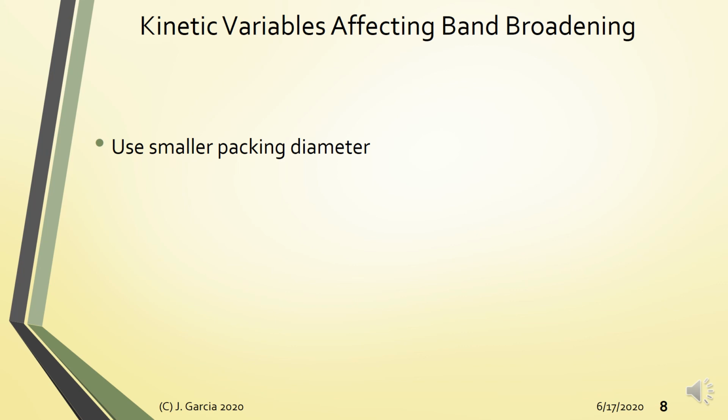So this is a type of HPLC system that has a more powerful pump, no? So since you have a more powerful pump, no, it can actually withstand higher back pressures, no? So here you can use columns with finer stationary phase particles. So ang magiging advantage ito is that you can afford to use higher flow rates, no? Higher flow rates would mean lower retention times, no? So hence you have lower run times, no?